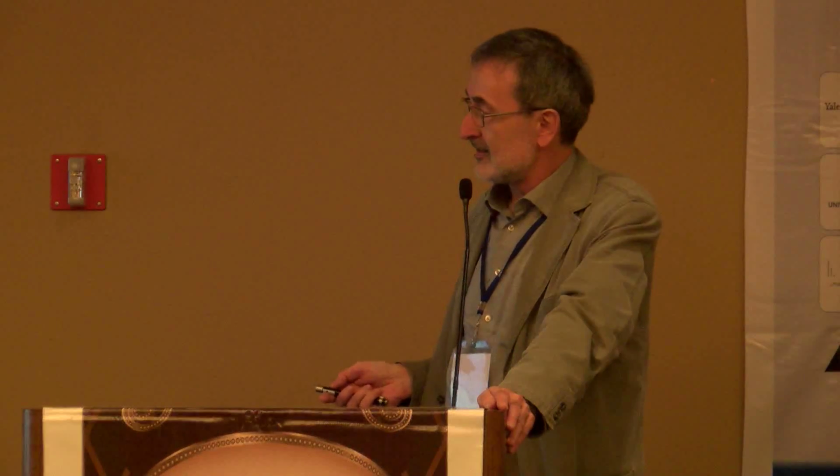For example, they may accumulate in trichomes on the surface of leaves, in root hairs or on root tips. They also may accumulate within special secretory cells within tissue, or they are also sometimes found around certain specialized cells of the leaf, and so on. We are looking for such compounds in order to establish their importance in ecological interactions. And the methods we are using, and which I will present here, are imaging techniques.